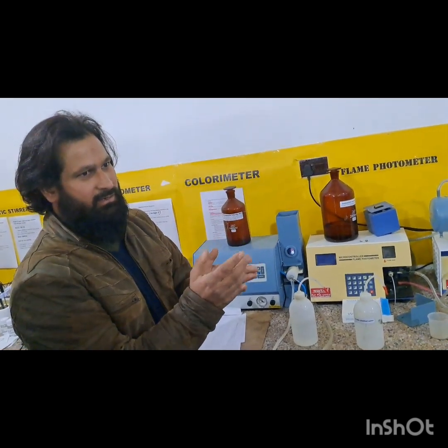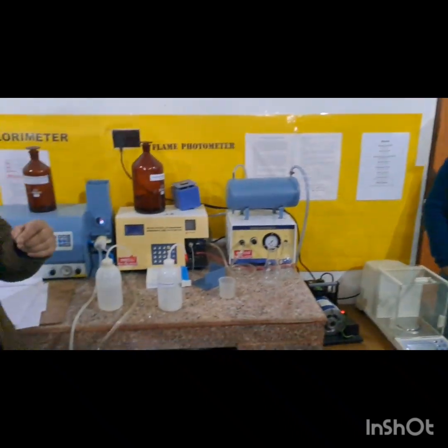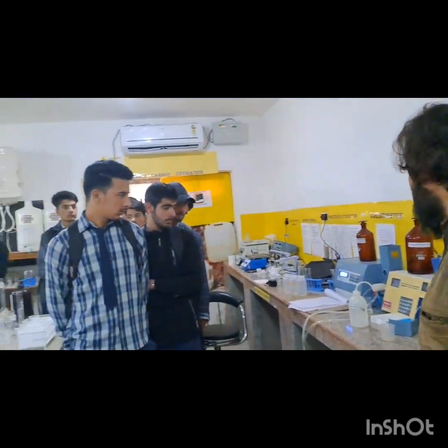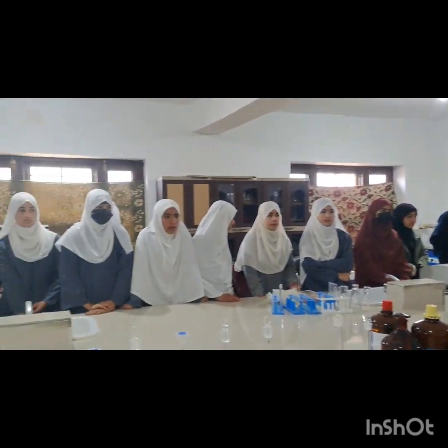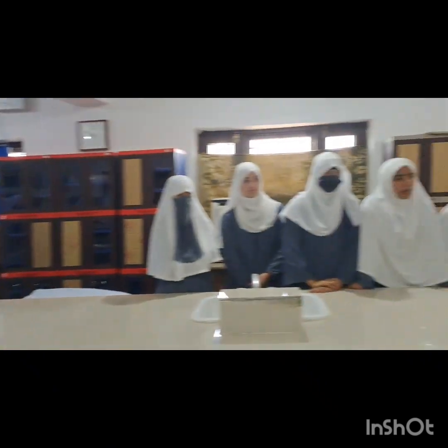Students expressed their appreciation for the opportunity to visit the soil testing lab. They found the hands-on experience invaluable in understanding the practical aspects of science they study in classrooms. The escort teacher, Mr. Tawheed Parvaiz Bhat, commended the lab staff for their informative guidance and welcomed future collaborations for educational purposes.